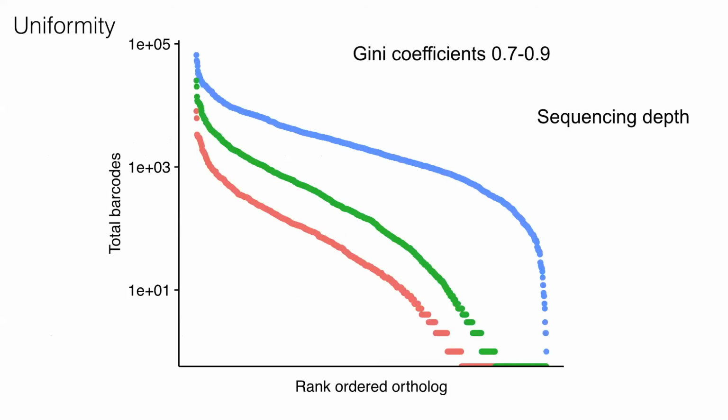Uniformity is still a serious issue, and we believe this has its roots in 2 different effects. One is synthesis effects in the underlying oligos. As I said before, most vendors will claim that you have very good uniformity in your oligo distribution. Of course, it depends what you synthesize, and there are definitely sequence effects, with certain motifs causing lower representation.